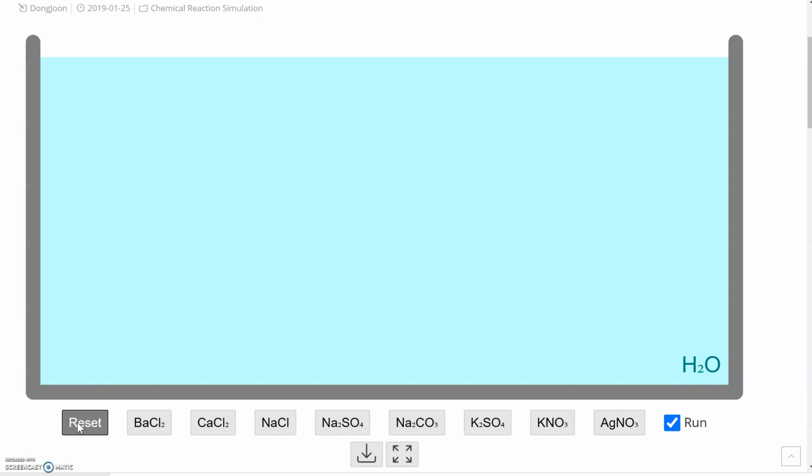All right, so our 2 purposes are to fill out our data table. In other words, which of these reactions produce precipitates, and then we're going to choose one and use that as our example, and that's where we'll get our screenshots from.